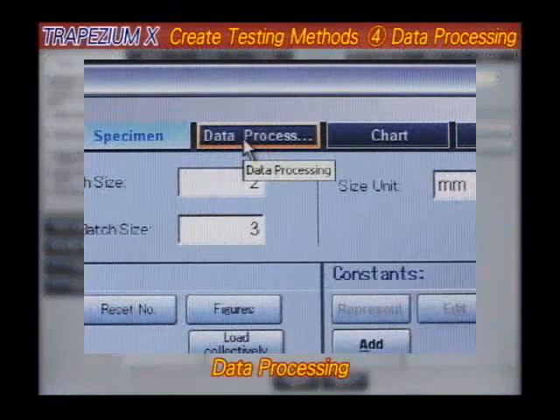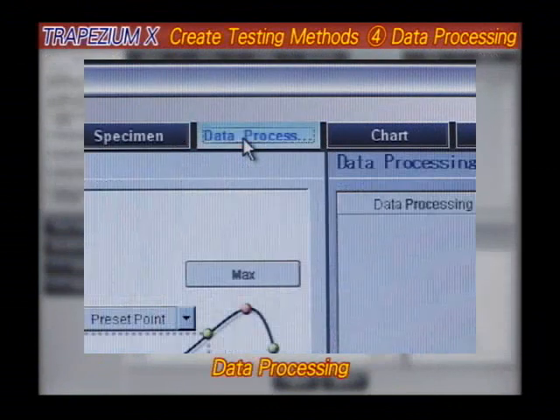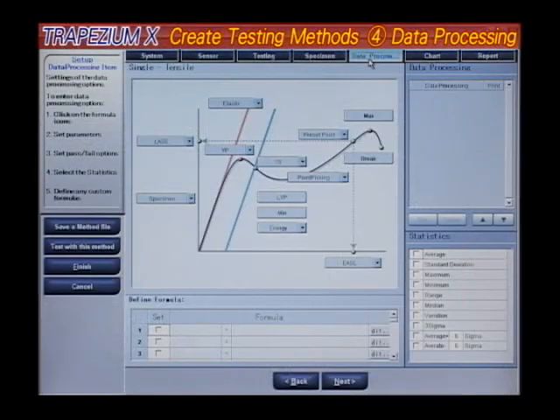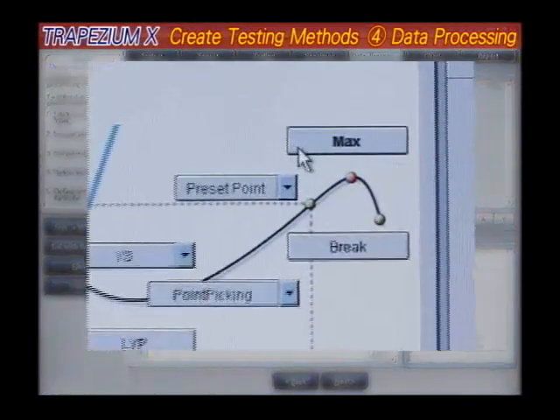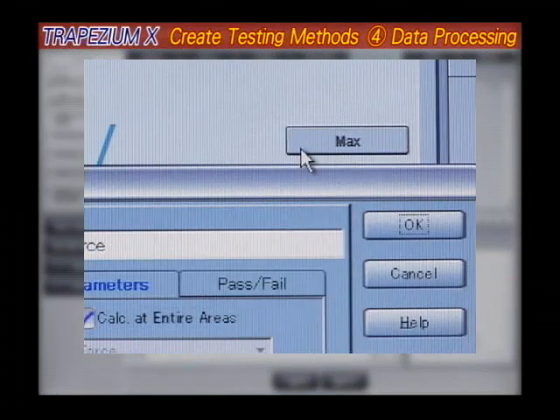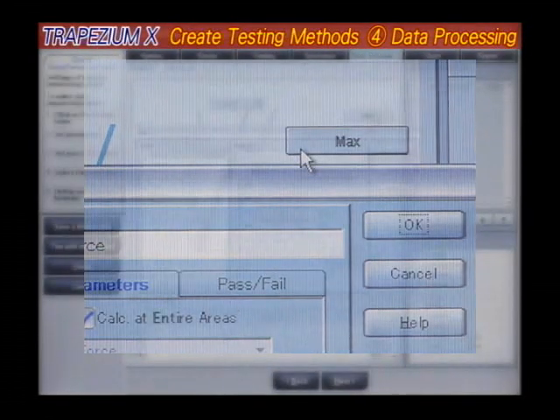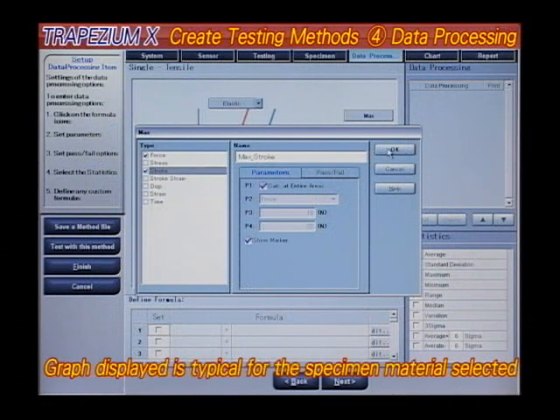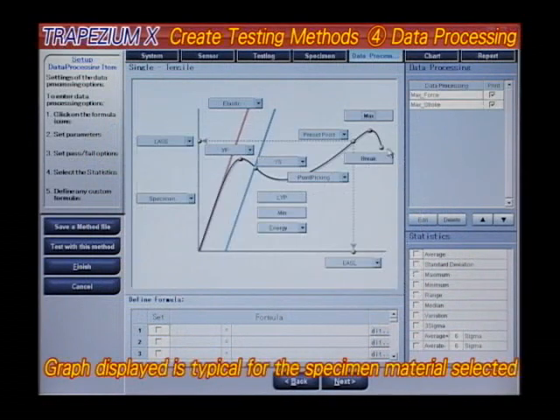Data Processing. The easy-to-understand graphs shown here are used to specify data processing parameters. Trapezium X then displays the most typical graph for the settings selected.